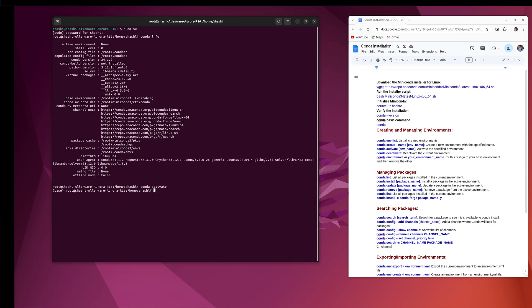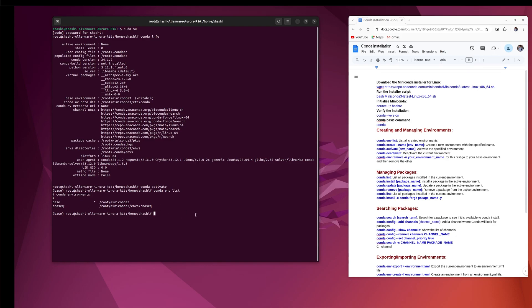After running conda activate, you can see the root is changed and it is now showing base — this is the environment of Miniconda. If you type conda env list, this will show you all the environments that have been created. Base is the default, but I created an rnaseq environment earlier, so you can see there are two environments in my system.